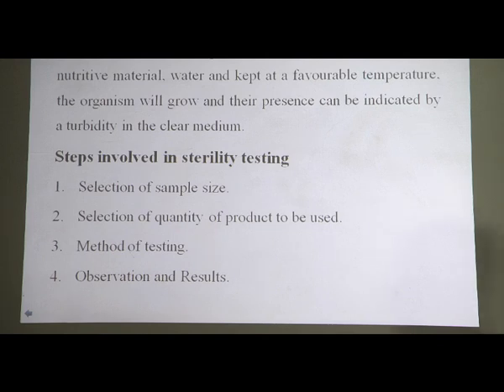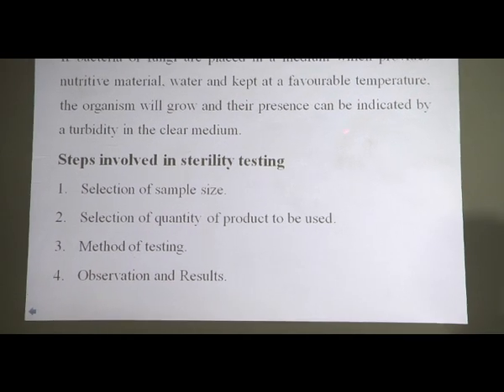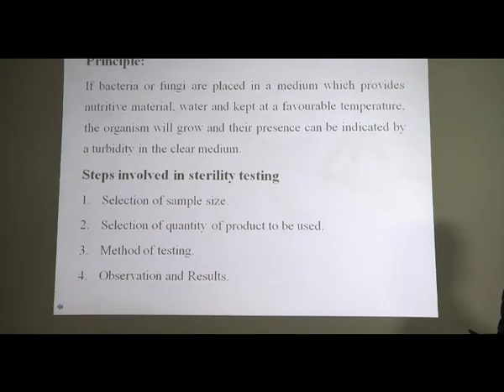The principle of the sterility test is that if bacteria or fungi are placed in a medium that provides nutritive material and water, and kept at a favorable temperature, the organism will grow and its presence can be checked by turbidity in a clear medium.